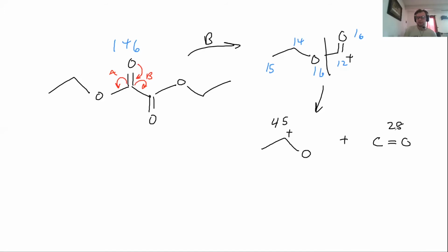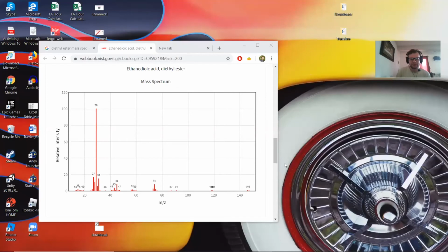And you got 28. And we did see those on our screen, so I'll share that. We're seeing that 45 right there. Here's our 28 right in the middle. So it comes up a little bit. That 45 is significant, so we probably would see those.